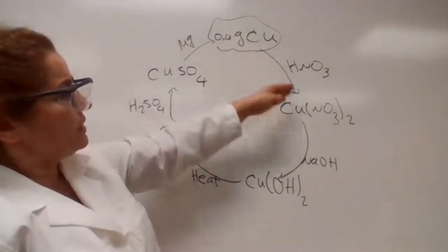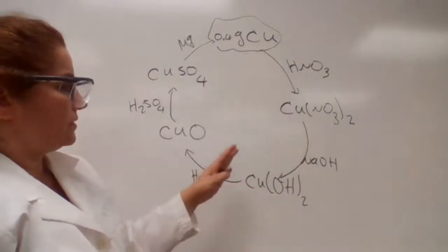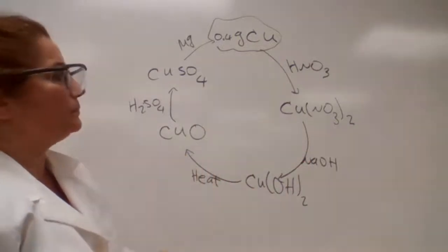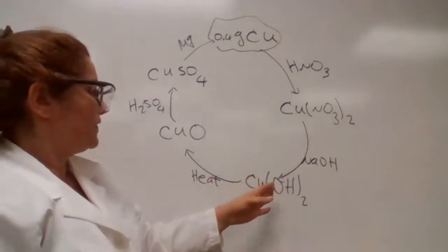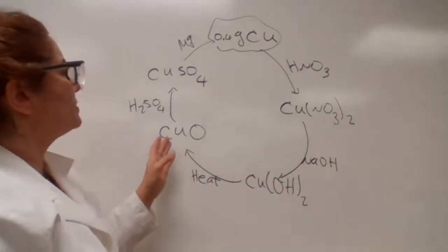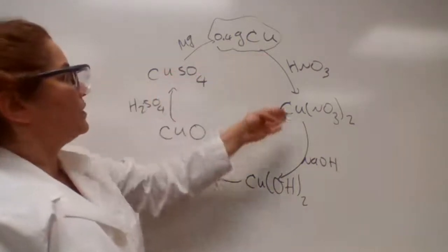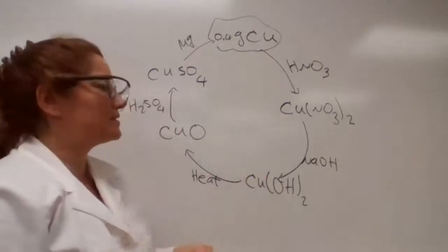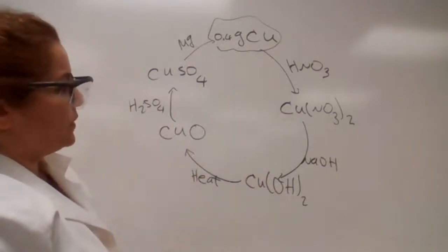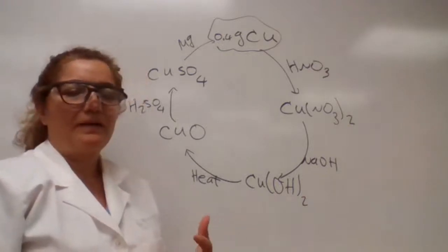So we are going to learn about different types of chemical reaction, like oxidation reduction, or decomposition type reaction, or single displacement reaction, and we are also going to learn different lab techniques. One of the lab techniques is decanting.